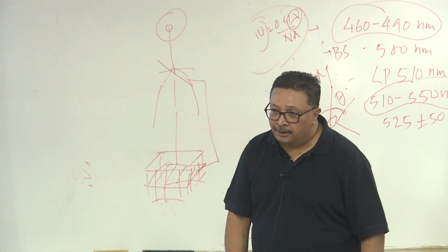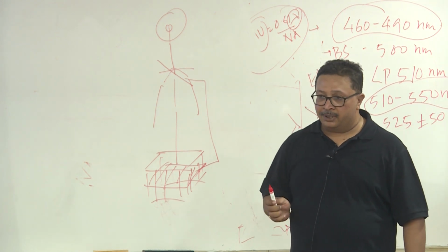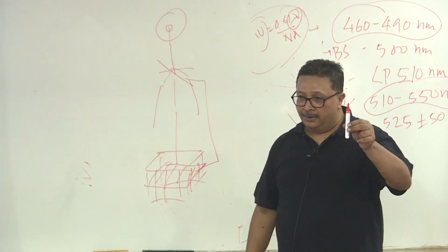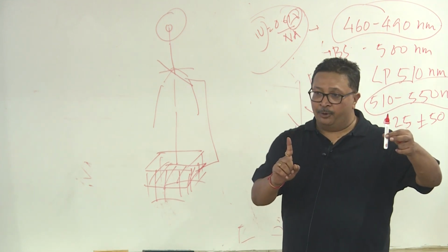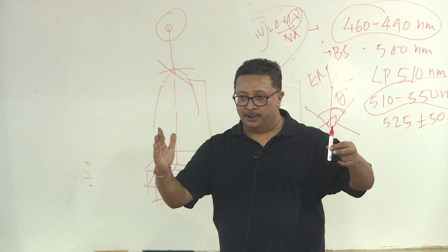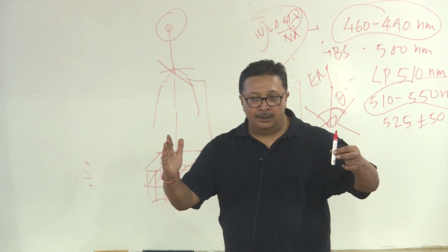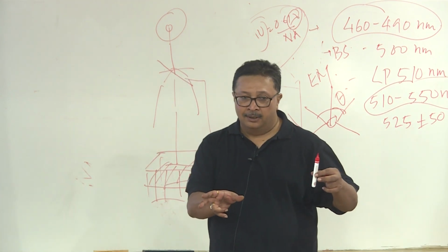Basic light diagram. Have you studied optics? You have an object at this position, a lamp or light source at this position, and a lens at this position. Where is the image formed? On the opposite side, inverted, at the same distance. Same concept.